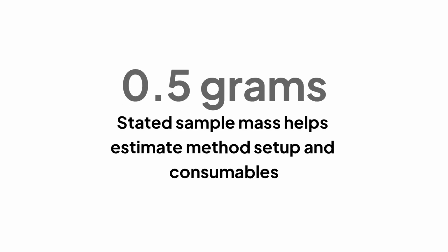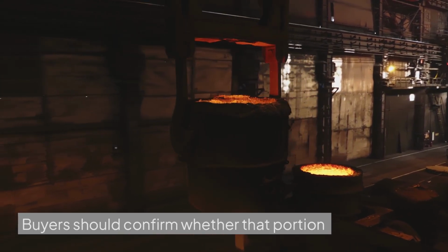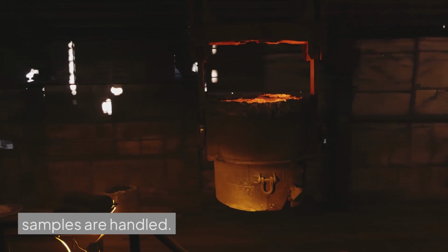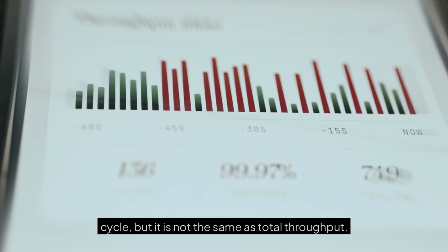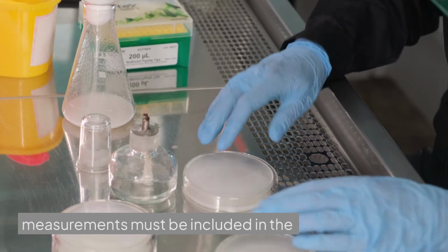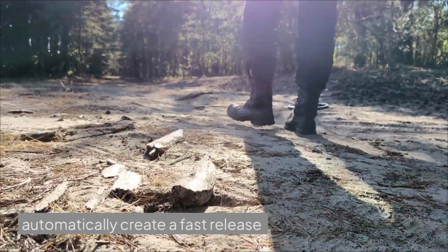A stated sample mass of 0.5 grams can help estimate method setup and consumable use, but it does not replace a preparation specification. Buyers should confirm whether that portion is suitable for their cast iron, steel, alloy, or cement matrices, and how repeat samples are handled. The JIEBO CS996 is described with a 0.5 gram standard sample weight and an analysis time of 25 to 60 seconds. That interval is useful for understanding the instrument cycle, but it is not the same as total throughput. Sample transport, preparation, furnace loading, result review, cleaning, and repeat measurements must be included in the sample-to-decision calculation. A short detector cycle does not automatically create a fast release decision.